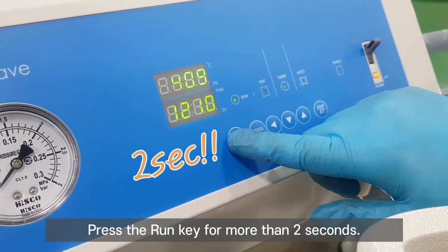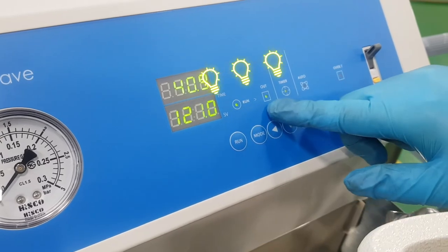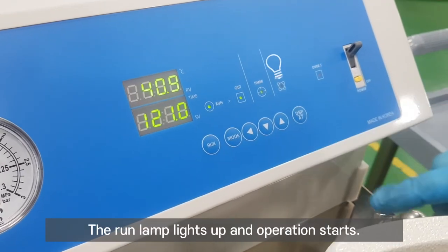Press the run key for more than 2 seconds. The RUN lamp lights up and operation starts.